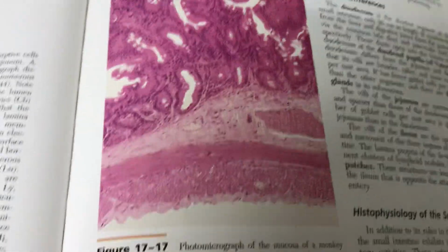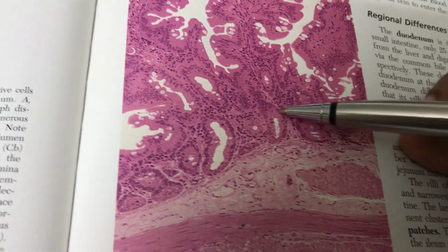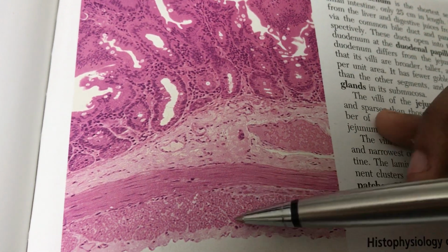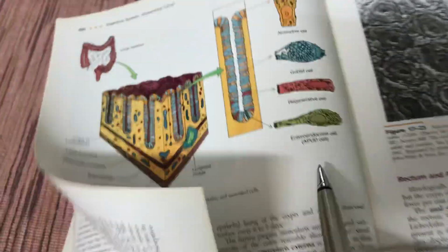And the next layer is the jejunum. In the jejunum, you can see the long villi and crypts of Lieberkühn, and no Brunner's gland, no Peyer's patches, and inner circular and outer longitudinal layer, and last the serosa is seen. So no such difference you can see in the jejunum. Next I will go to the ileum.